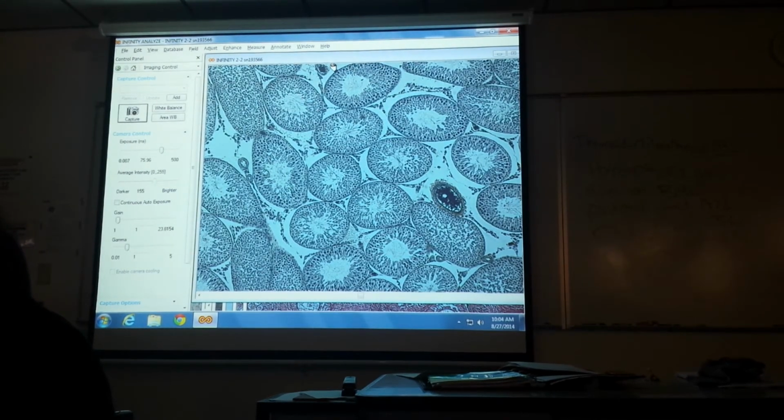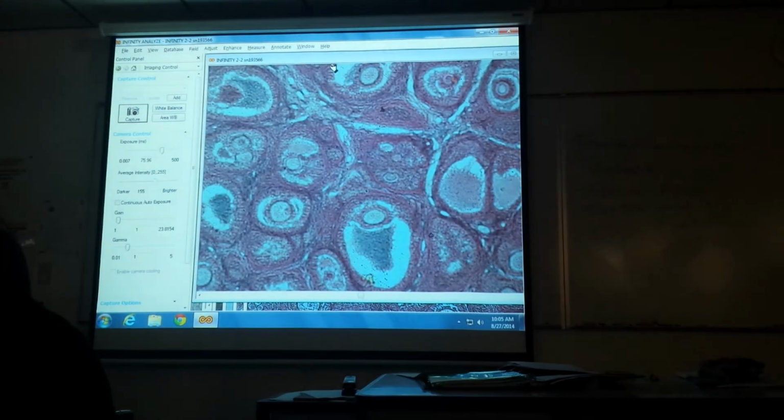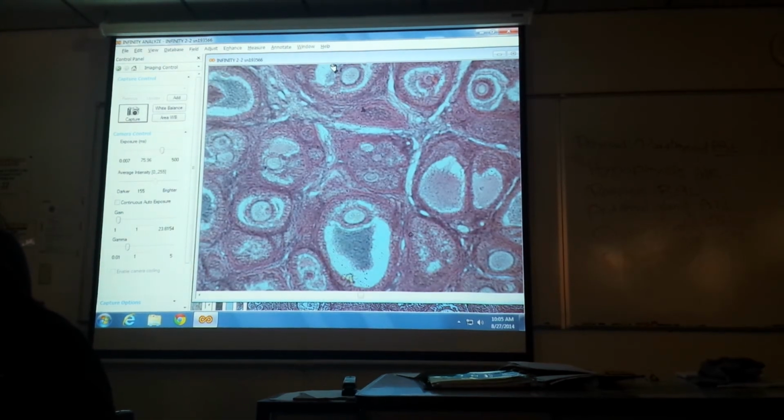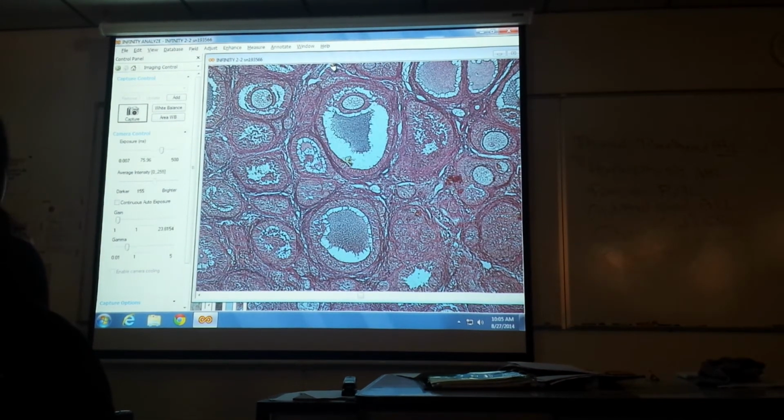Did you show us the vesicular follicle on the ovary? Oh. No, I didn't. I forgot that was there. Yeah, you need to know that, that's important. Let me go back to that. Thanks for catching that. Look for those on a big follicle like a Graafian.